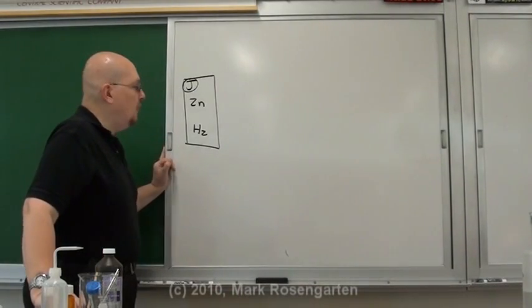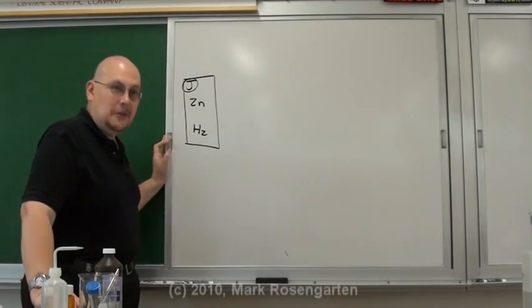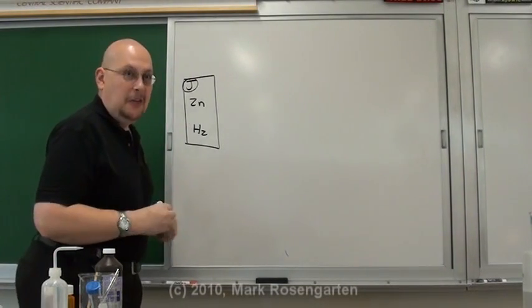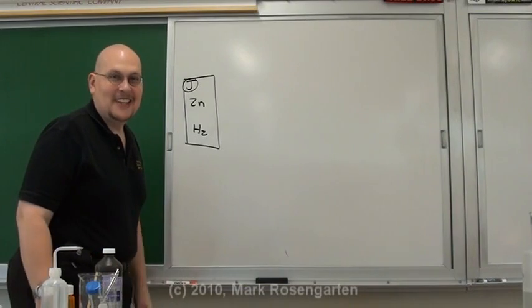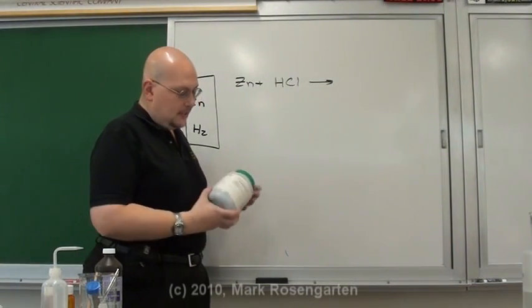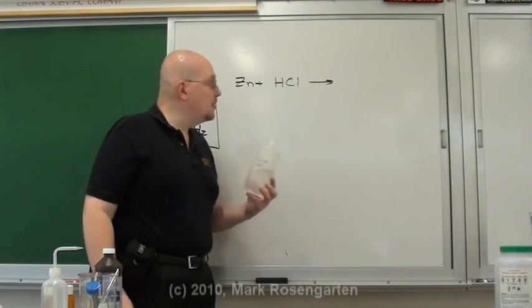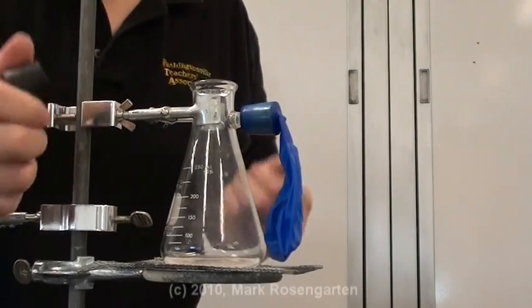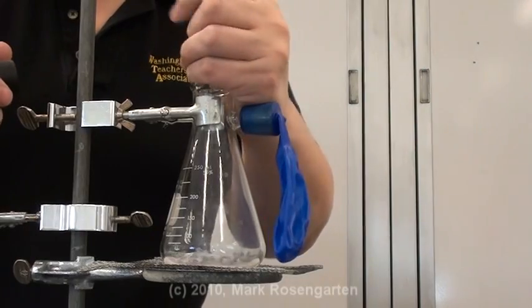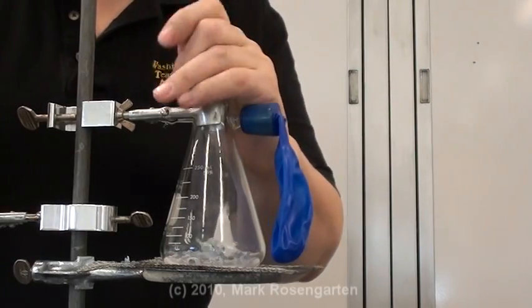Now according to reference table J, zinc is more active than hydrogen. Any metal that's more active than hydrogen can be eaten away by an acid. So what I'm going to do is I'm going to take some zinc and react it with some hydrochloric acid. Let's see what it makes. So the zinc gets put into this Erlenmeyer flask.